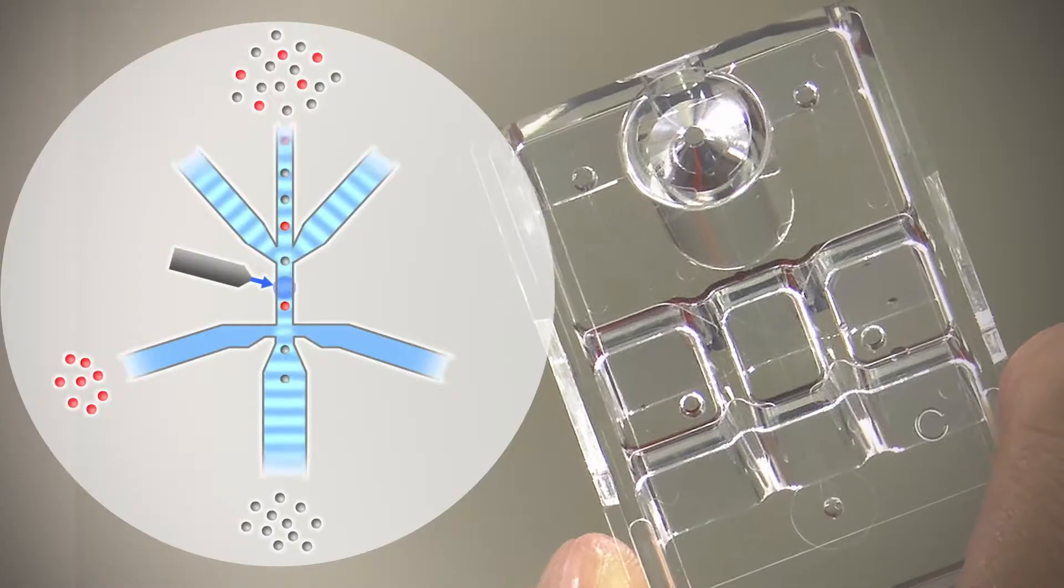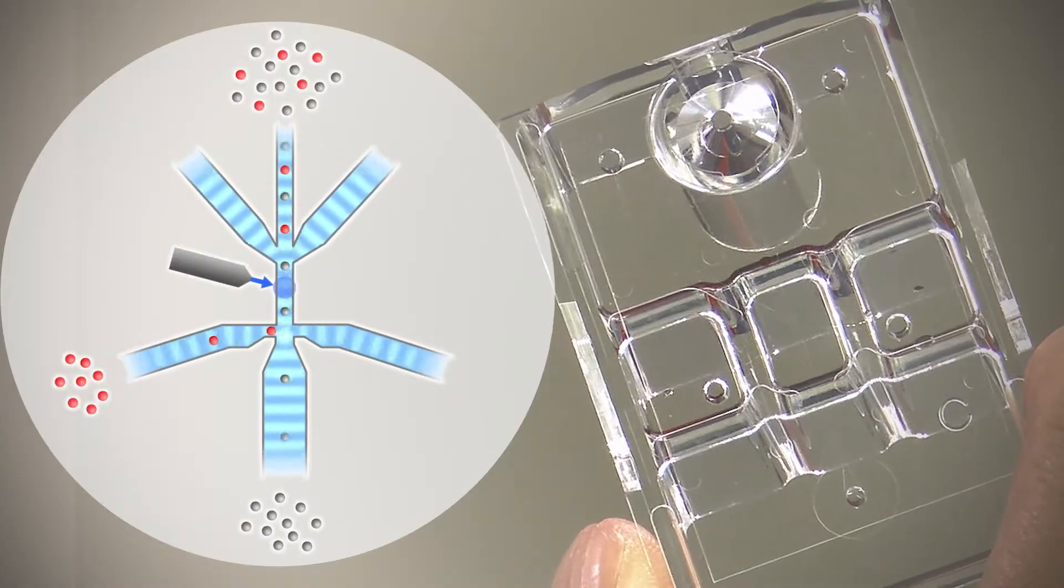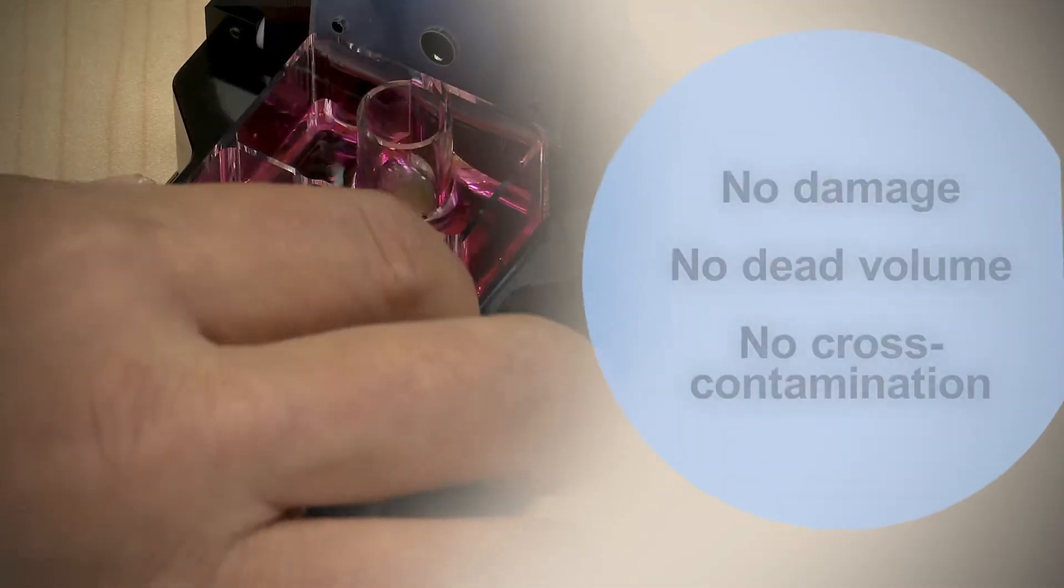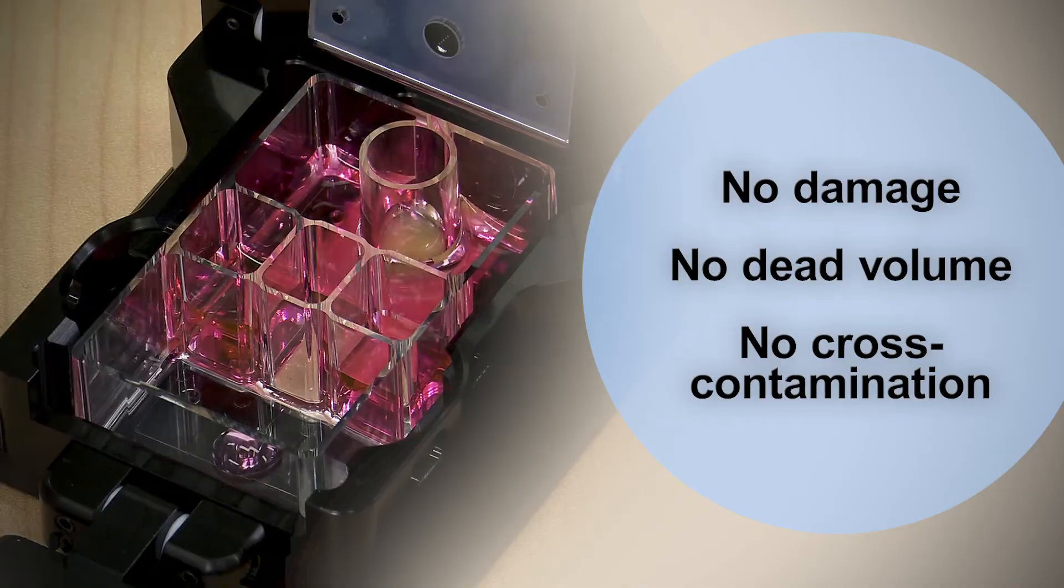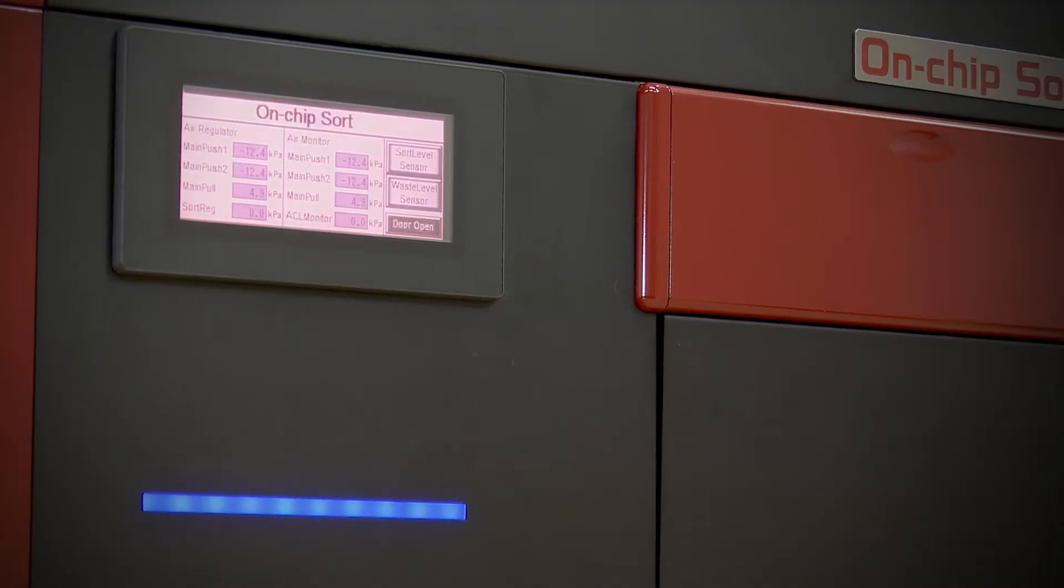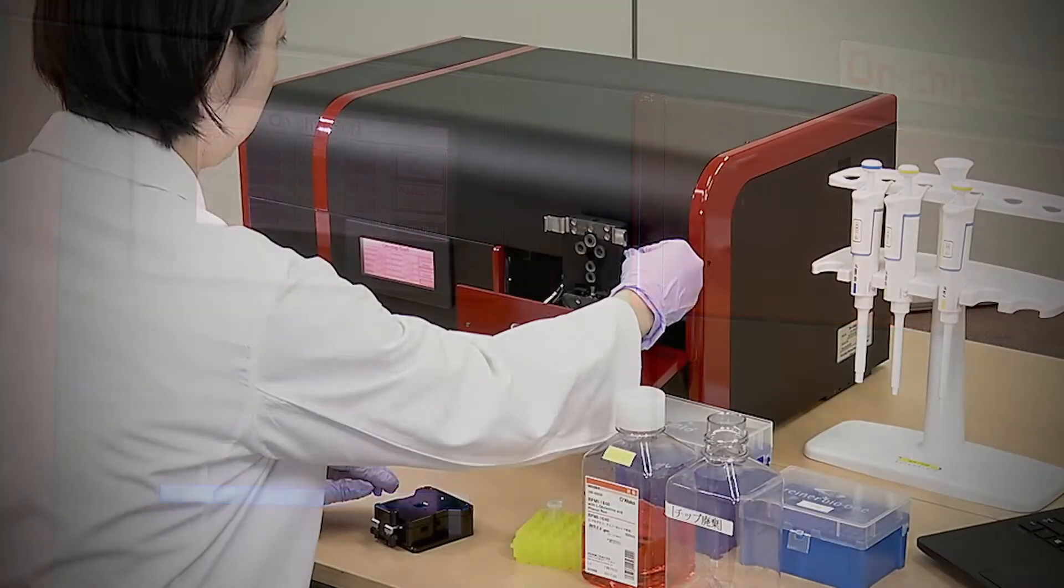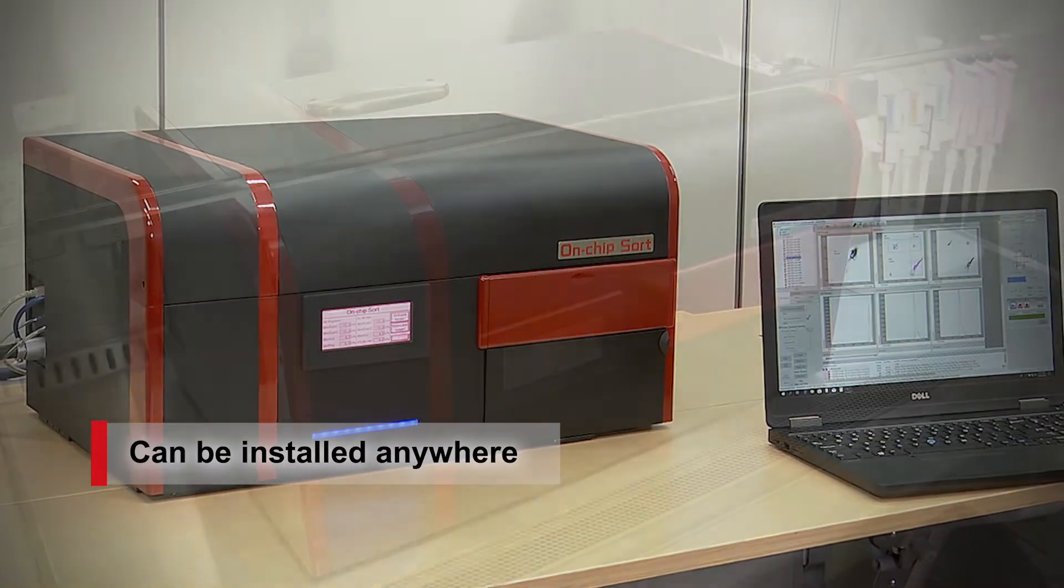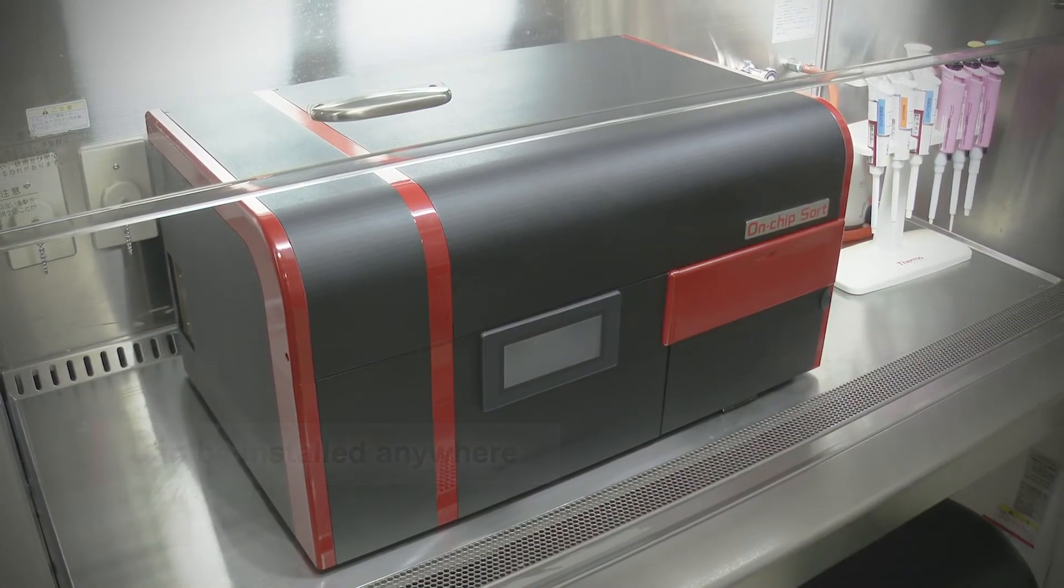On-chip Sort enables contamination-free and damage-free sorting with the use of a disposable microfluidic chip. The entire sample can flow through via pneumatic actuation. The sorter is simple and easy to use. The main unit is very compact and can be installed anywhere, such as on a bench or inside a hood.